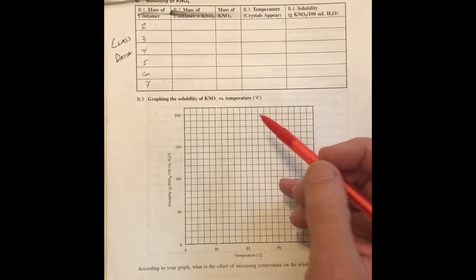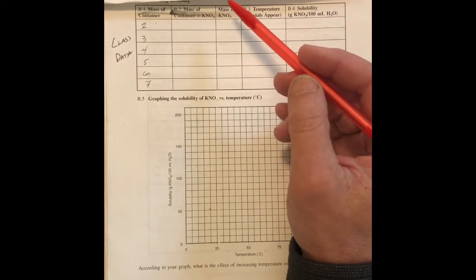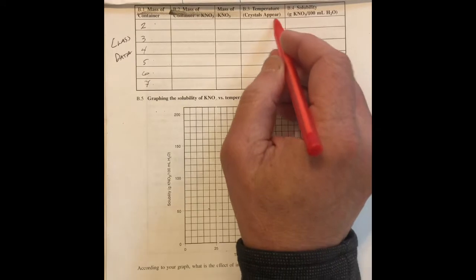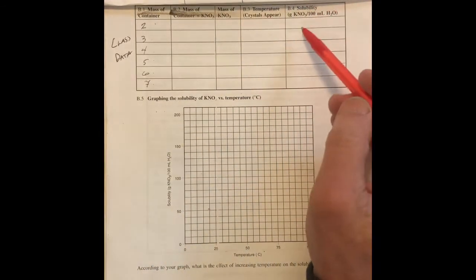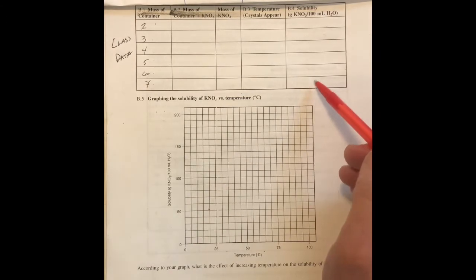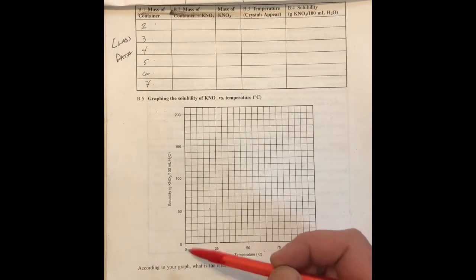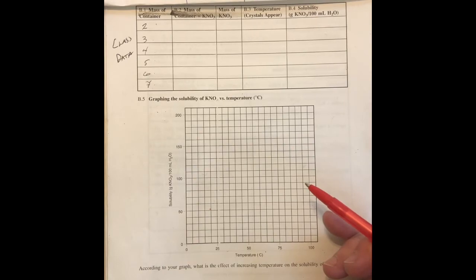All right, so to put this in practice then, what you want to do is on your report sheet, copy these numbers down, and I'll just leave them at the end of the video, into the temperatures. So again, these can all get squeezed into temperature, and the solubility, the 40, 60, 80, etc., are going to be these here. When we plot, the solubility is your up and down axis, and the temperatures are going to be the x-axis. So just like it shows on the sheet.